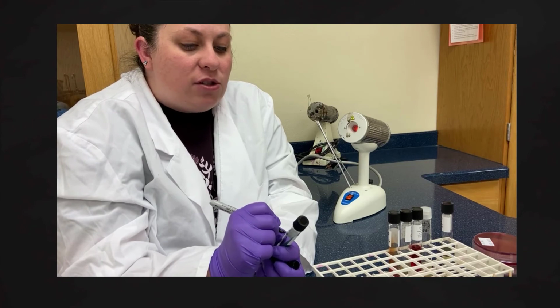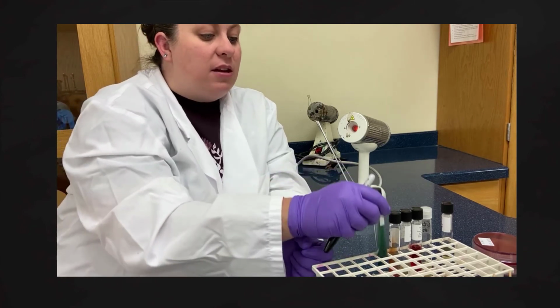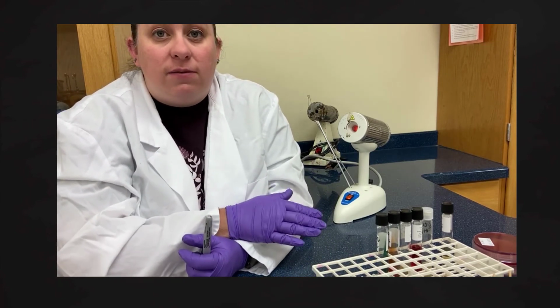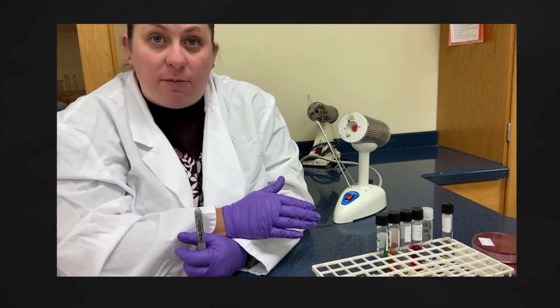Okay, now these are going to go into the incubator. Some of them have to be incubated longer than others. You have to pay attention to those times. But they're going to go in the incubator, and this is going to allow us to then do further tests, especially when we look at certain things like our gram-negative bacteria.